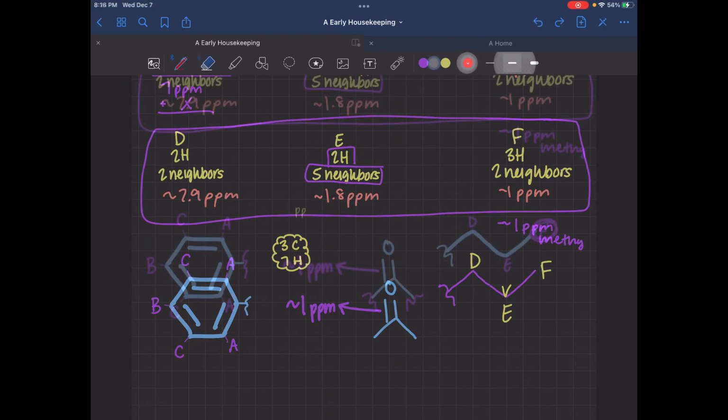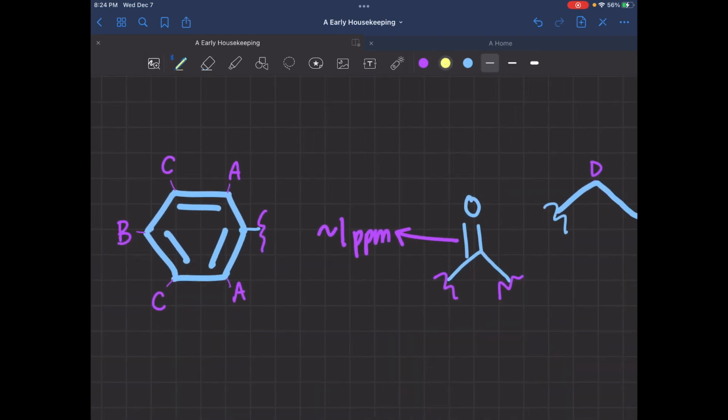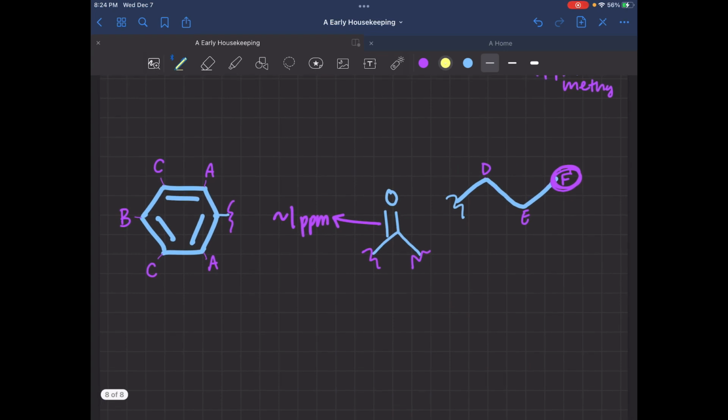Okay, so now let's start assembling. Let's take a look at this and try to assemble stuff. So we're going to start recalling some ppms. Let's recall A's ppm. A had a ppm of 8.7 from the ring, right? So where are we going to get that last ppm? Based on everything we have here, where could we get another ppm?